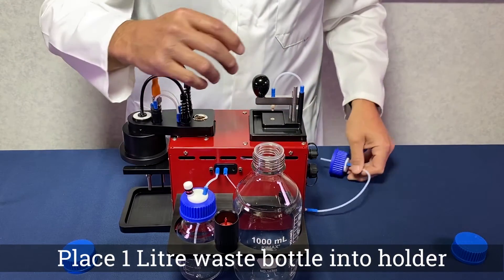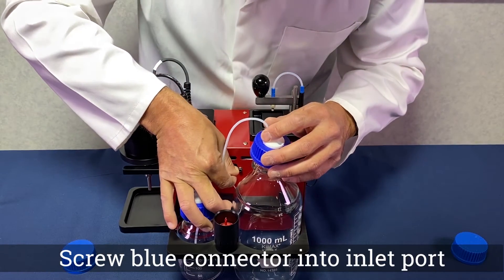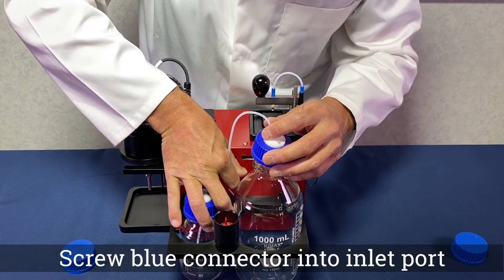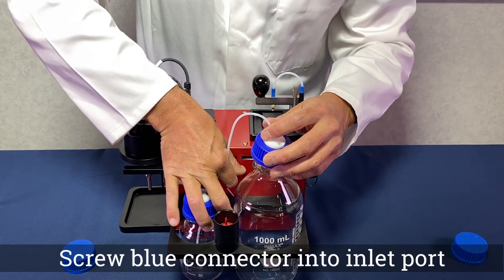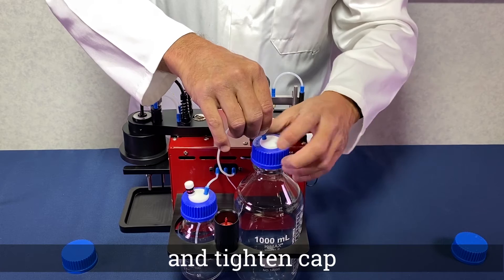Place the 1 litre waste bottle into the holder and screw the blue waste connector to the right hand port, and tighten the cap.